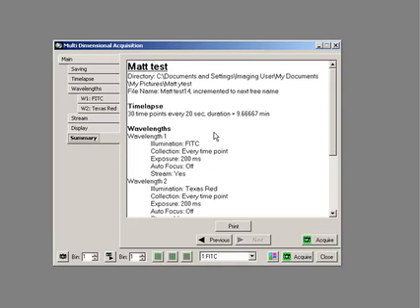If you need any more help or instructions with this at all, please let me know or contact Fedometrics UK or your local Metamorph dealer. Thank you.